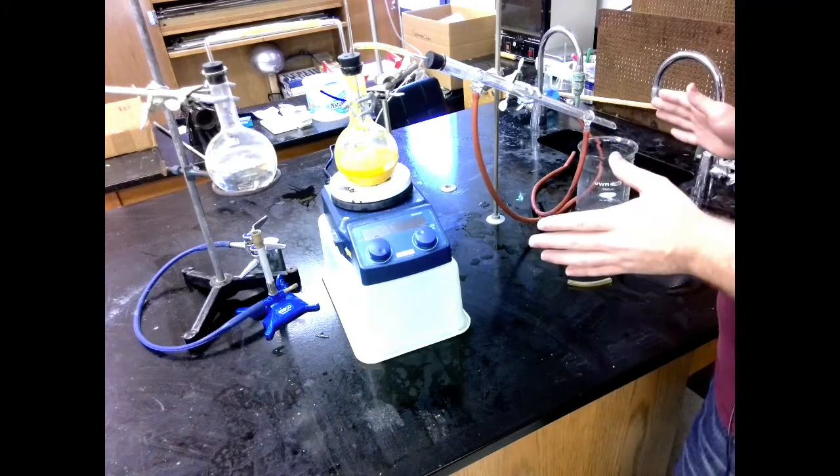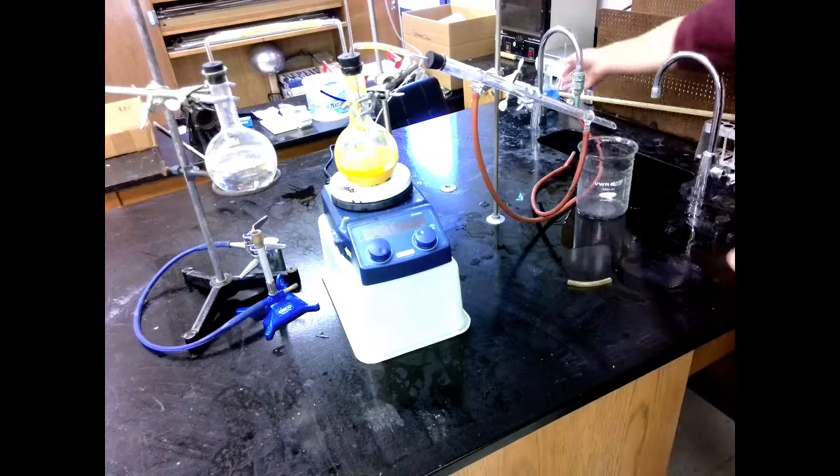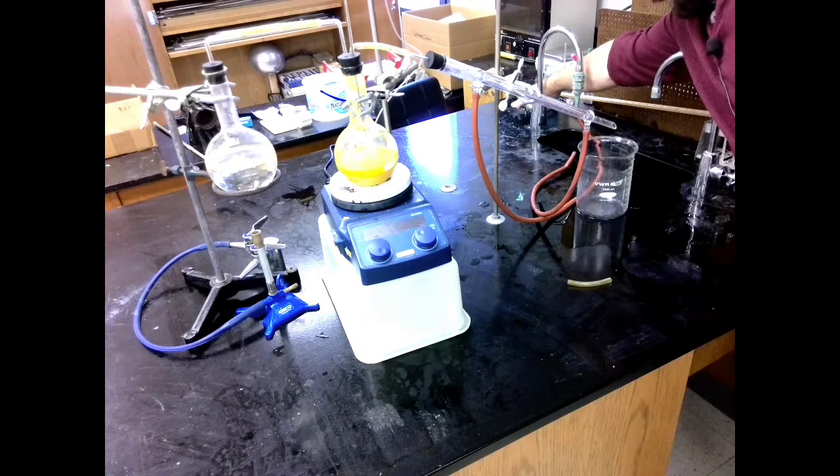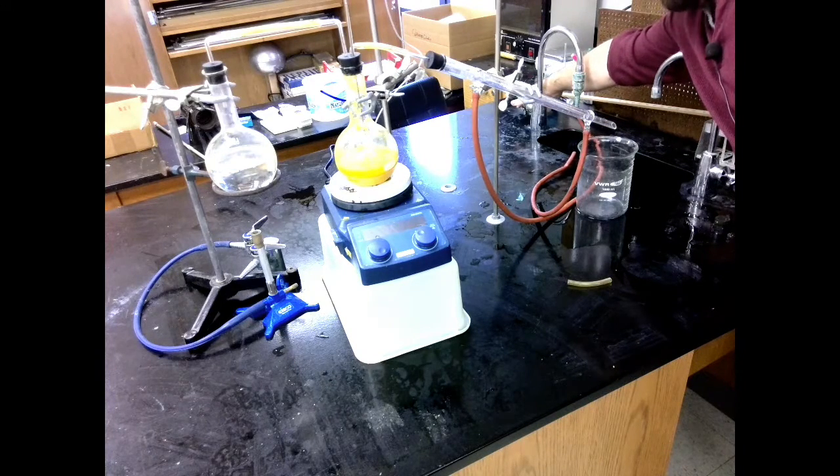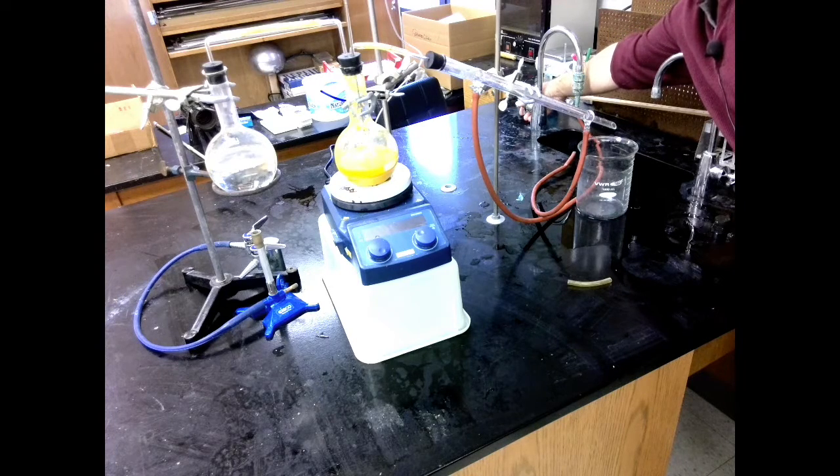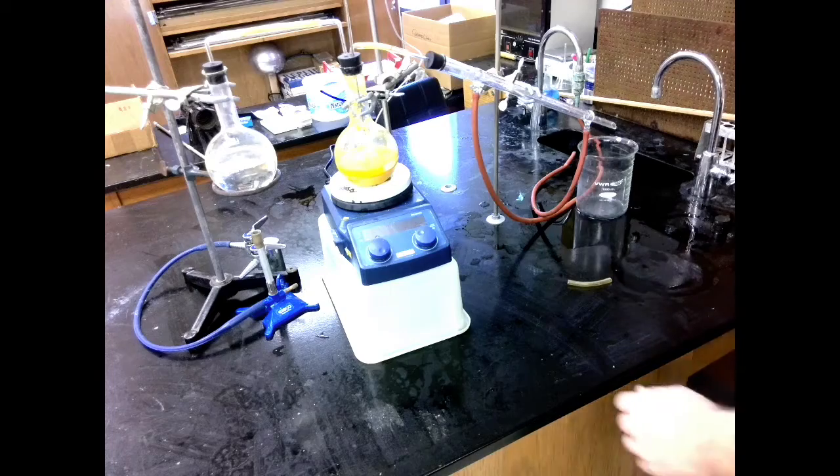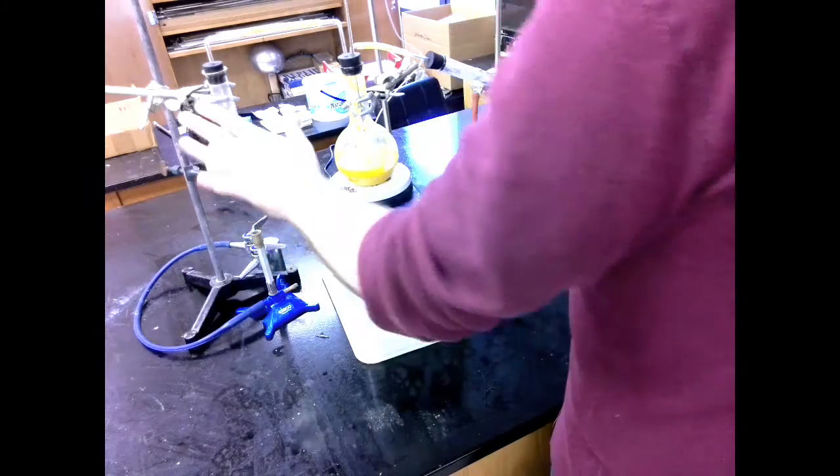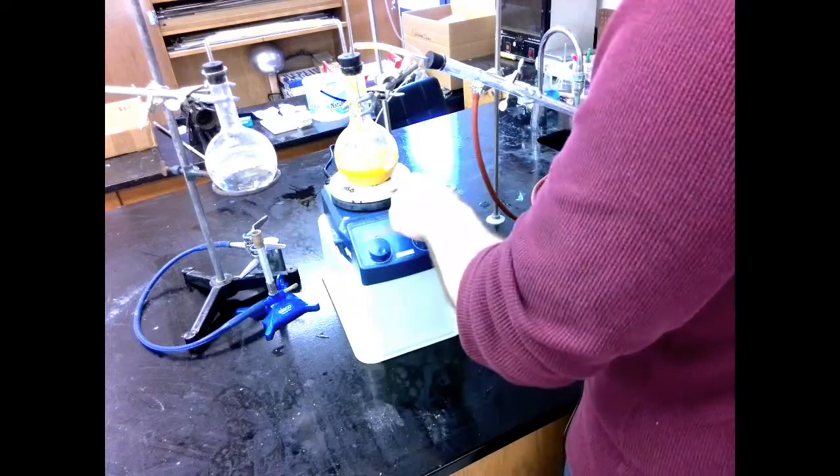First thing, we're going to turn on our condenser by turning on our water line. Just gently. Gentle flow. There we go, that's good. Next, I'm going to start my Bunsen burner. It's important that I start my Bunsen burner before I turn on my hot plate.